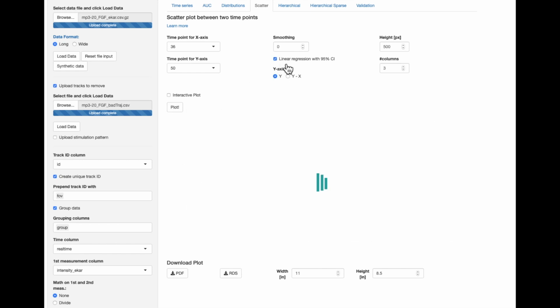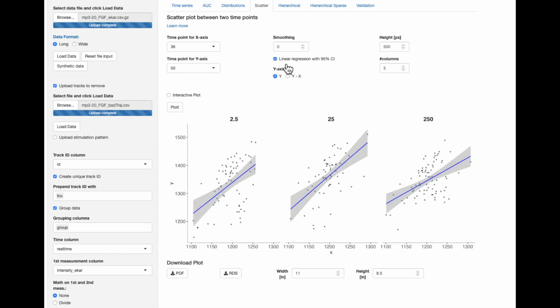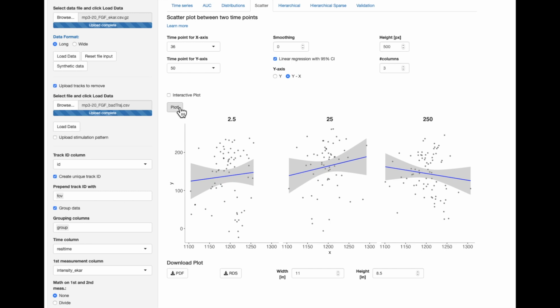On the y-axis, instead of showing the magnitude, we can also plot the amplitude relative to the time point chosen on the x-axis. As you can see, the correlation between the first peak magnitude and the baseline is around 0. This means that before clustering, we can safely normalize our time series to their own baseline. This should help with clustering, and it's quite a common step in this kind of analysis.